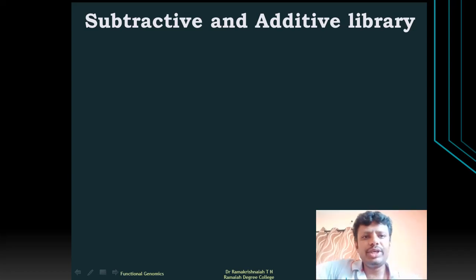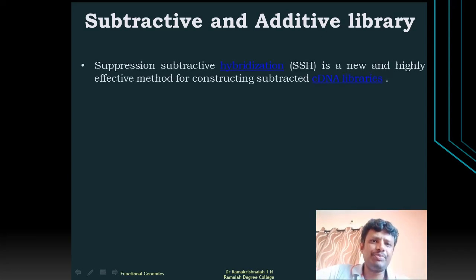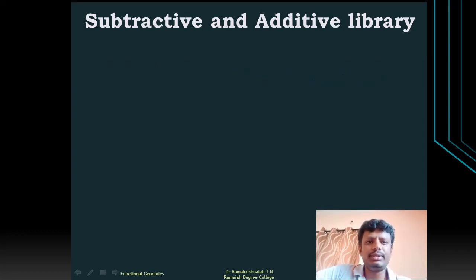Welcome back, students. In this video, I'll be discussing the next assay, which is called the subtractive and additive assay to build the cDNA library or RNA library. So it's a subtractive and additive library. Additivity means adding some molecules to make sure that the whole total RNA is captured with specificity. So that is the subtractive and additive library.